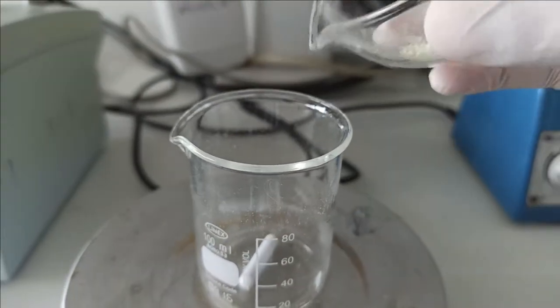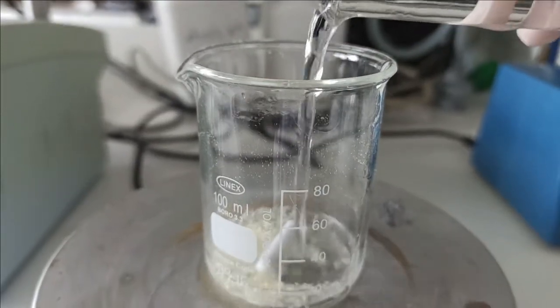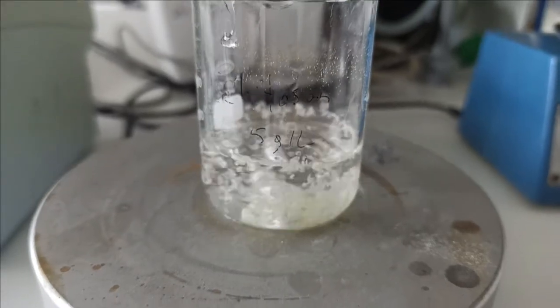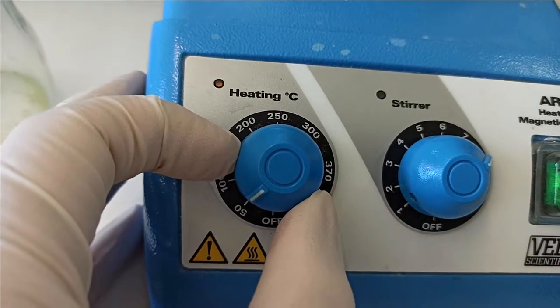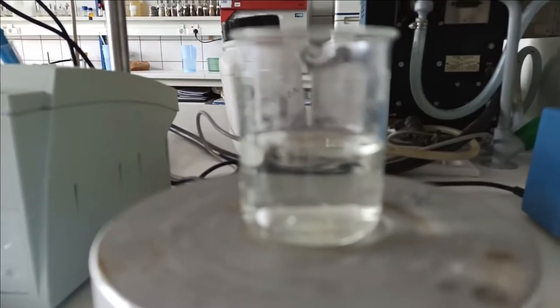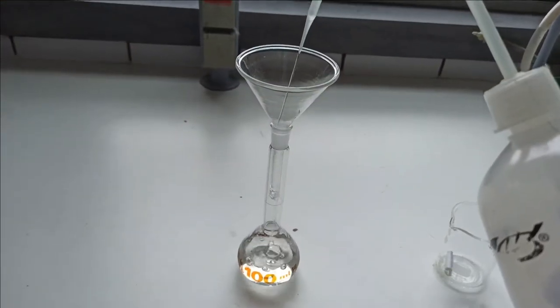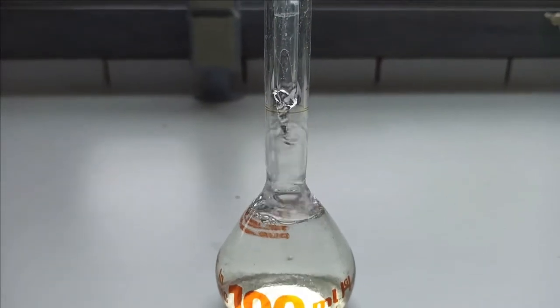First we prepare a chitosan solution of 5g per liter by first dissolving it in 0.1mol of hydrochloric acid. As chitosan is not easily dissolved, you may increase temperature to around 50 degrees. After 30 minutes the solution should be already clear. Add then the same amount of volume with ultra-pure water to achieve the final concentration.